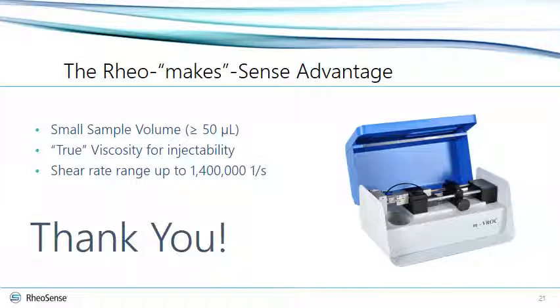We have a second question. Is the true viscosity concept being accepted by FDA? Well, true viscosity is not a new concept. The true part is just added to point out that that's the actual viscosity of the sample. That's the material property that it should be independent of the system that you're measuring with. So, just pointing out the difference with an index or an apparent viscosity measurement. And as such, it does not require specific acceptance by the FDA.